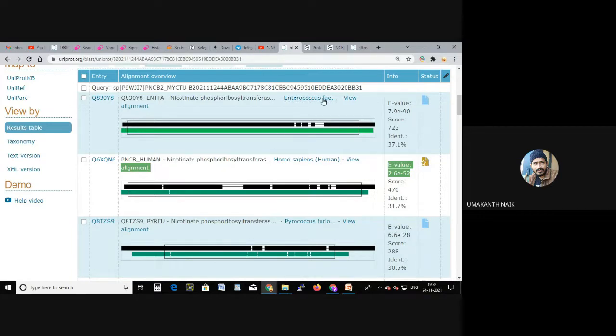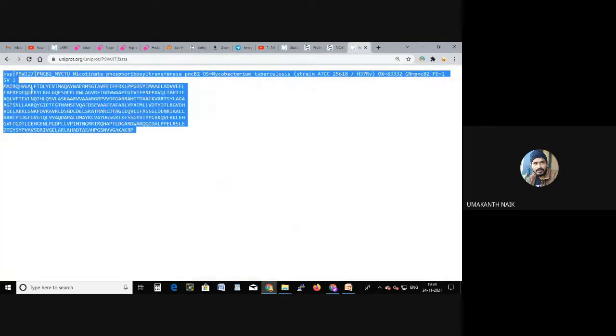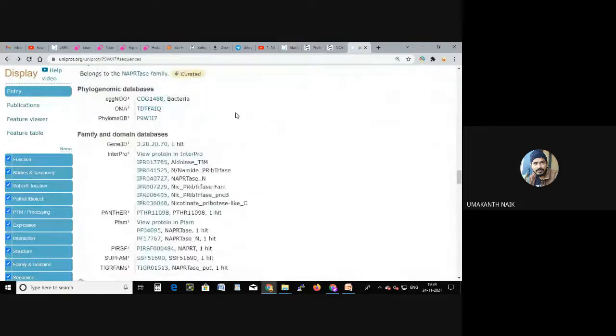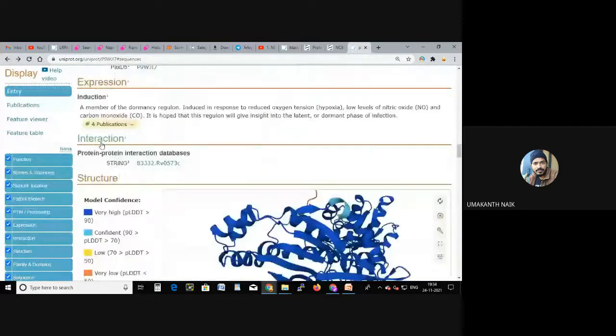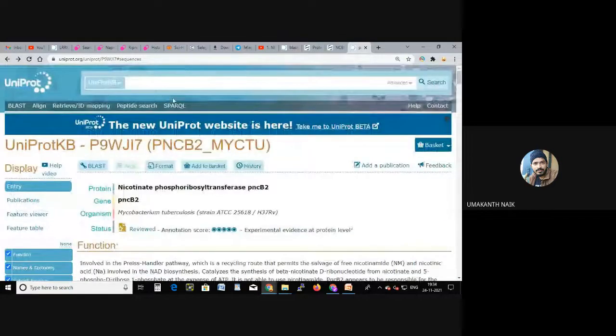So let me go for a sequence similarity search now. I'll go for sequence alignment now. But we'll go for a hands-on demonstration for this using Clustal X.